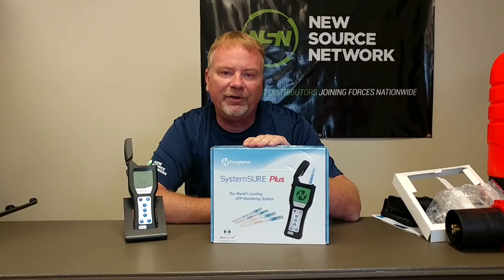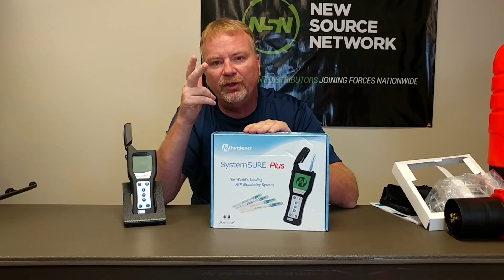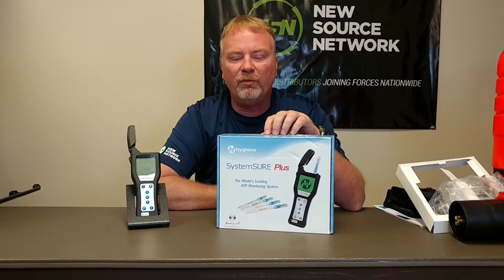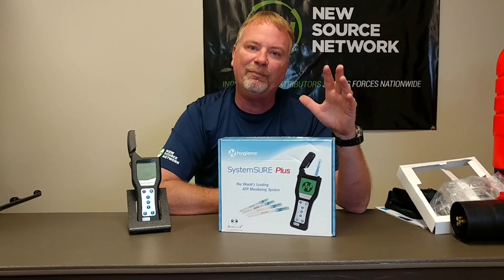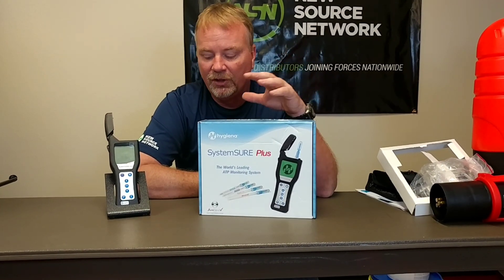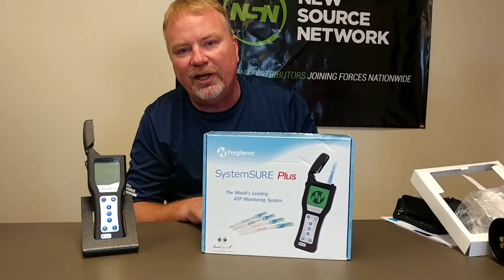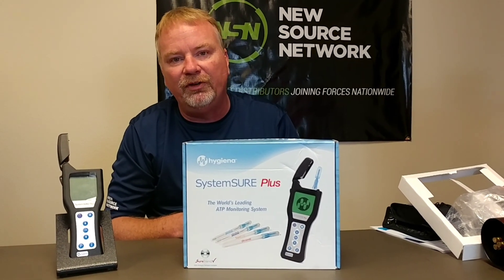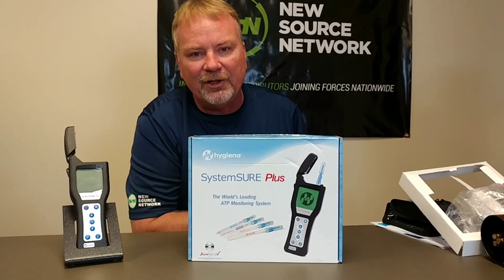This is number four of the installment on how to disinfect for COVID-19. What we've shown you so far is how to clean it and what to clean it with, how to disinfect it and what to disinfect it with using electrostatic sprayers and the Bio-esque. Now this thing right here is something new that we're selling and it's absolutely incredible. It's a hygienic ATP meter. ATP stands for adenosine triphosphate — basically what it measures are microorganisms. When you have too many ATPs in one area, COVID-19 can live in those microorganisms. You touch the surface, rub your face, and you've got COVID-19. If you kill the ATPs down to a certain level, then COVID-19 cannot live on the surface — and that's the point of disinfecting.